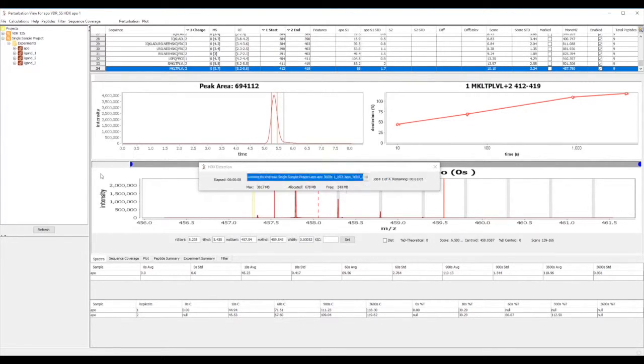So a key time saver here again is that we're skipping the entire T0 detection step for all of the subsequent ligand experiments. In addition, we're running the HDX detect reusing the working peptide set from the APO experiment.